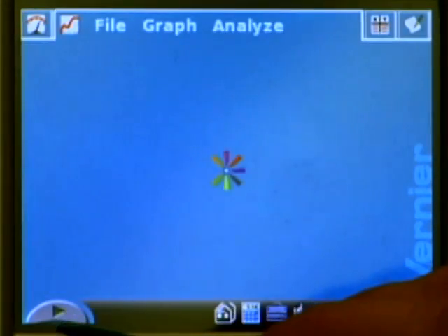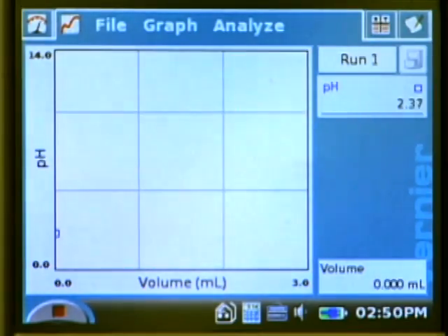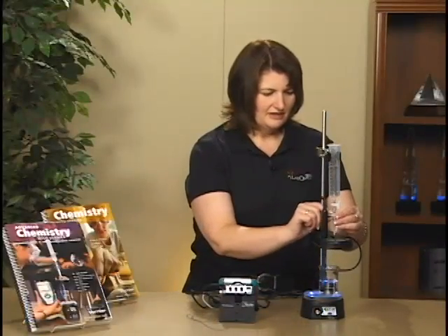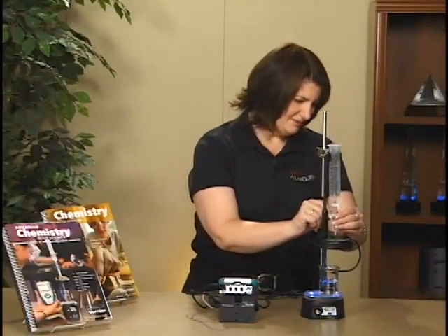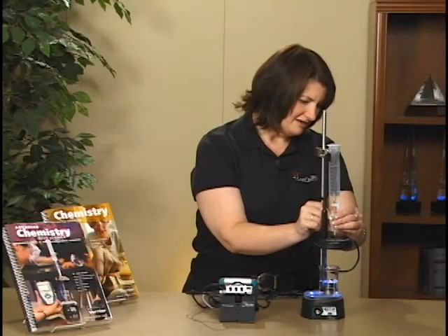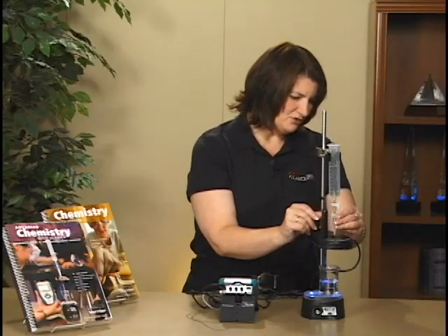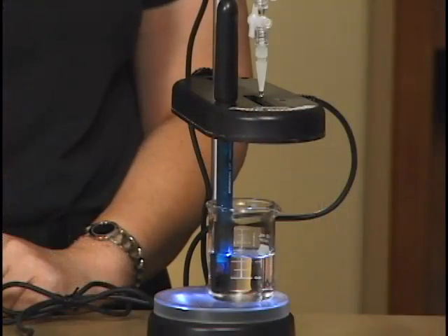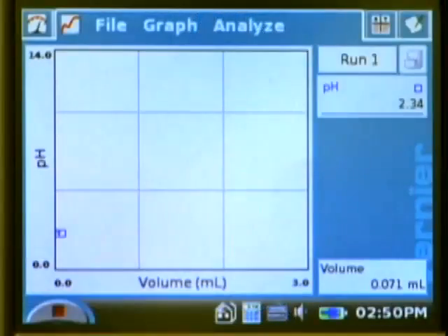I just need to tap on the collect button and now it's waiting for a drop to come through. I open the stopcock on my drop counter and my drops come through one every one or two seconds or so. This is counting away and the titration will progress until we stop it.